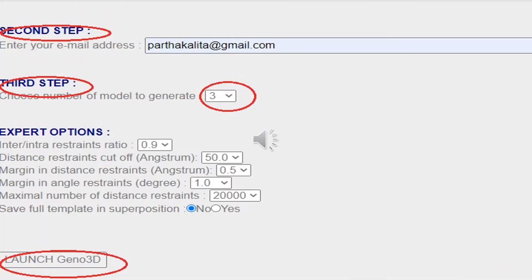After selecting the templates, in the next step you have to provide your email ID, as the Xeno 3D server will send the results to your email. Then, in the third step, you have the option of choosing the number of models — a maximum of 10 models can be generated. We have selected three models to generate.